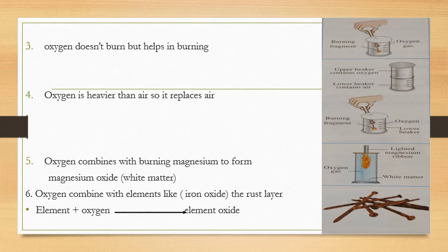In the first picture we have a beaker containing oxygen gas, and we prepare a burning fragment and then place the burning fragment inside the oxygen gas container.